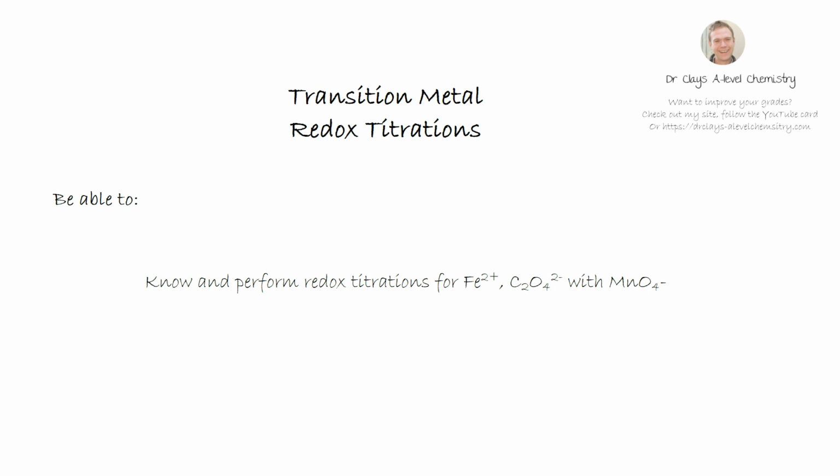And today we're looking at redox titrations, and by the end of this lesson we should know how to perform and about redox titrations for Fe2+, C2O4 2-, which is ethane dioate, and manganate.